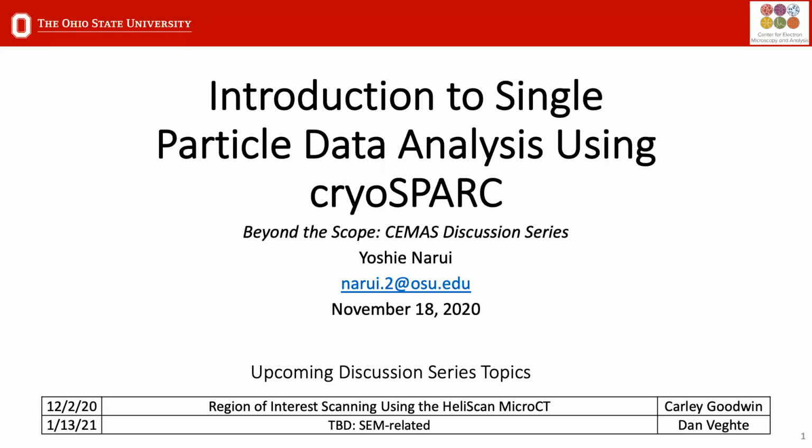It's inverted because it's just going in the total, as I do the jobs, if that makes sense. Since I already ran this job earlier, it's labeled job 3, so it just flip-flopped them. But here's the patch motion. Okay, so when I ran this job, I'm just going to open it. You can click on here and you see the tabs. What did I input when I built this job?